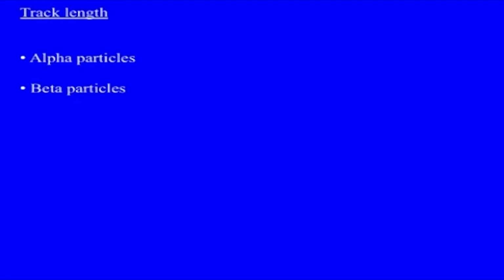All right, let us discuss alpha particles. As we have discussed earlier, an alpha particle is heavy, doubly positively charged and less penetrating. These massive particles are not affected by collision with electrons and usually maintain a straight path, and have a tremendous disrupting effect on orbital electrons as they pass through the emulsion.